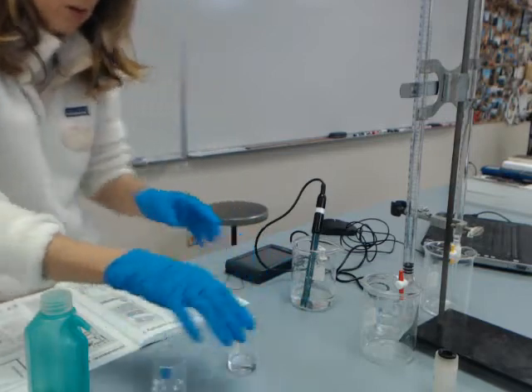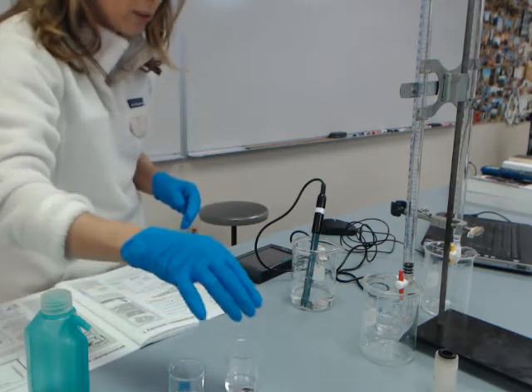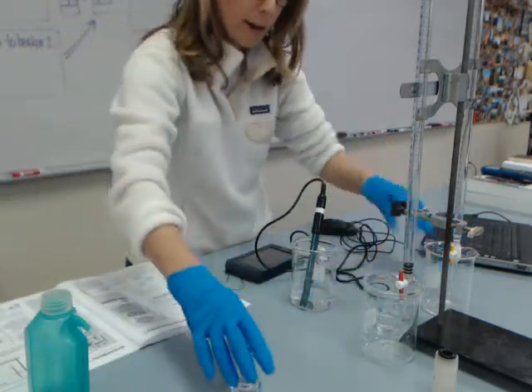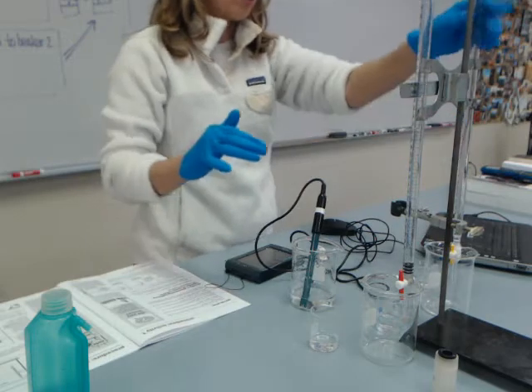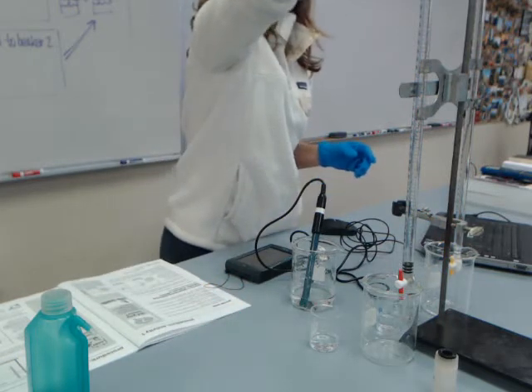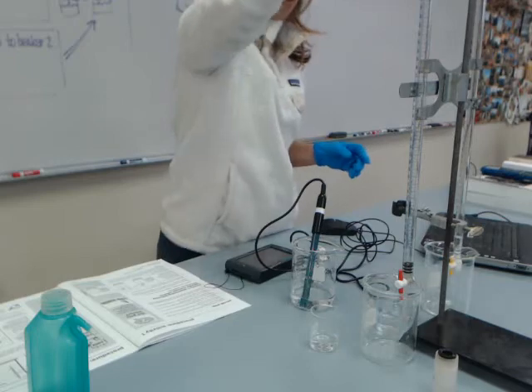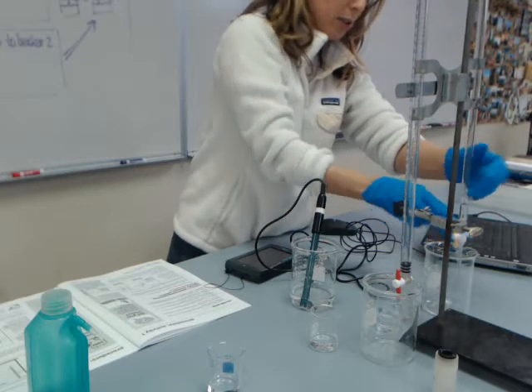I'm going to go ahead and rinse the inside of the burette out, pulling out with each one of these first. I've got my waste beakers underneath each burette. I'm going to put these in alphabetical order — the hydrochloric acid is going to be on the left, the sodium hydroxide on the right, as shown in the figure on the board from the flow chart earlier. So I'm going to lower this burette and rinse a little bit of it through.